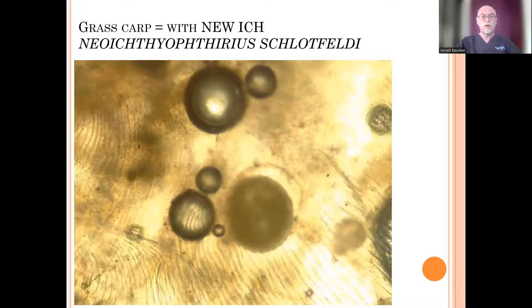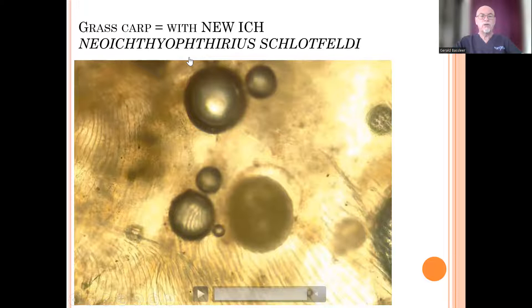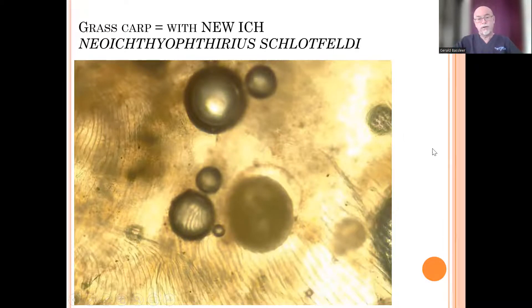Here is another white spot, and this is what we call the new Ichthyophthirius, or Neo Ichthyophthirius schlottfeldei — a nice name, identified already many years ago and unfortunately becoming more common in our aquarium industry and aquarium hobby.